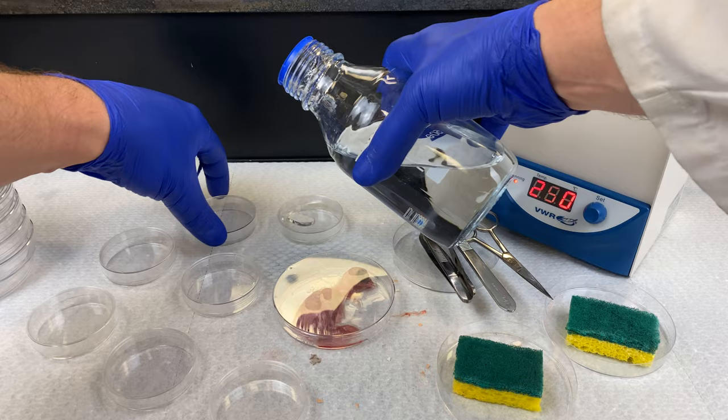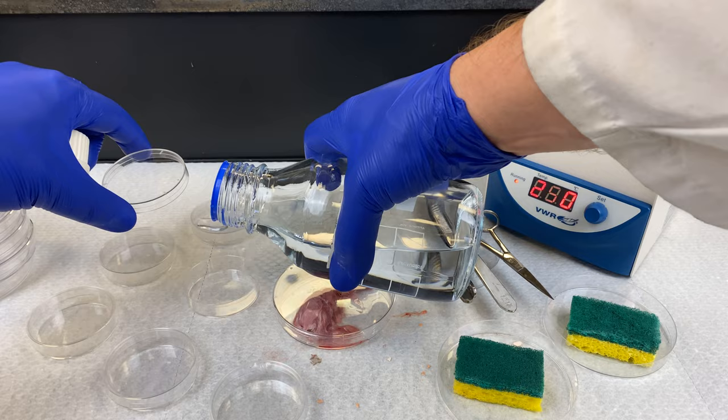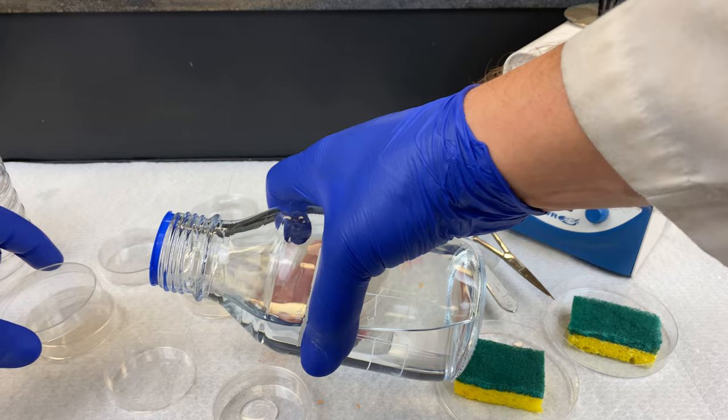Here I have some small petri dishes, and I'm pouring a small amount of PBS into the dish. This is so that the tissue does not stick to the plastic. We just want a small amount — don't make a kiddie pool's worth of PBS in there.